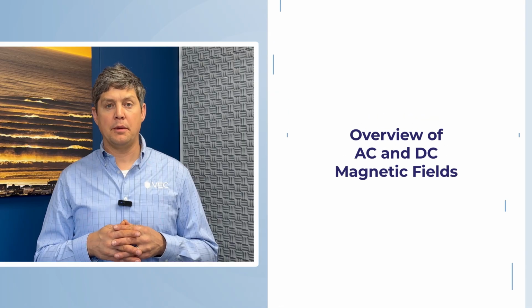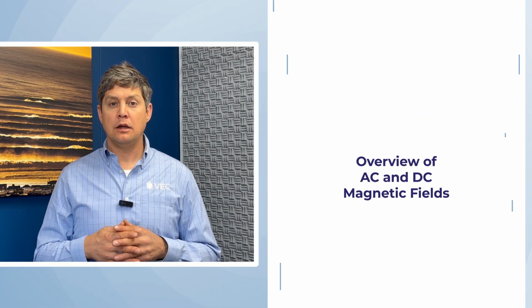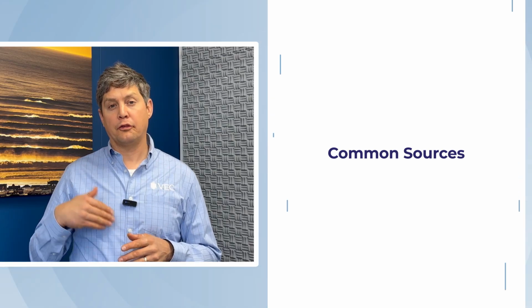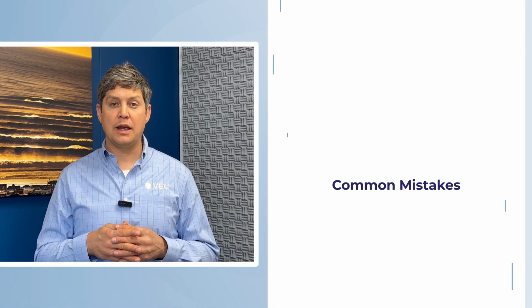We're going to talk to you a little bit about both AC and DC magnetic fields, some theory behind it, and common sources. We're also going to talk a little bit about mistakes and pitfalls we see customers make, and then strategies to avoid them.